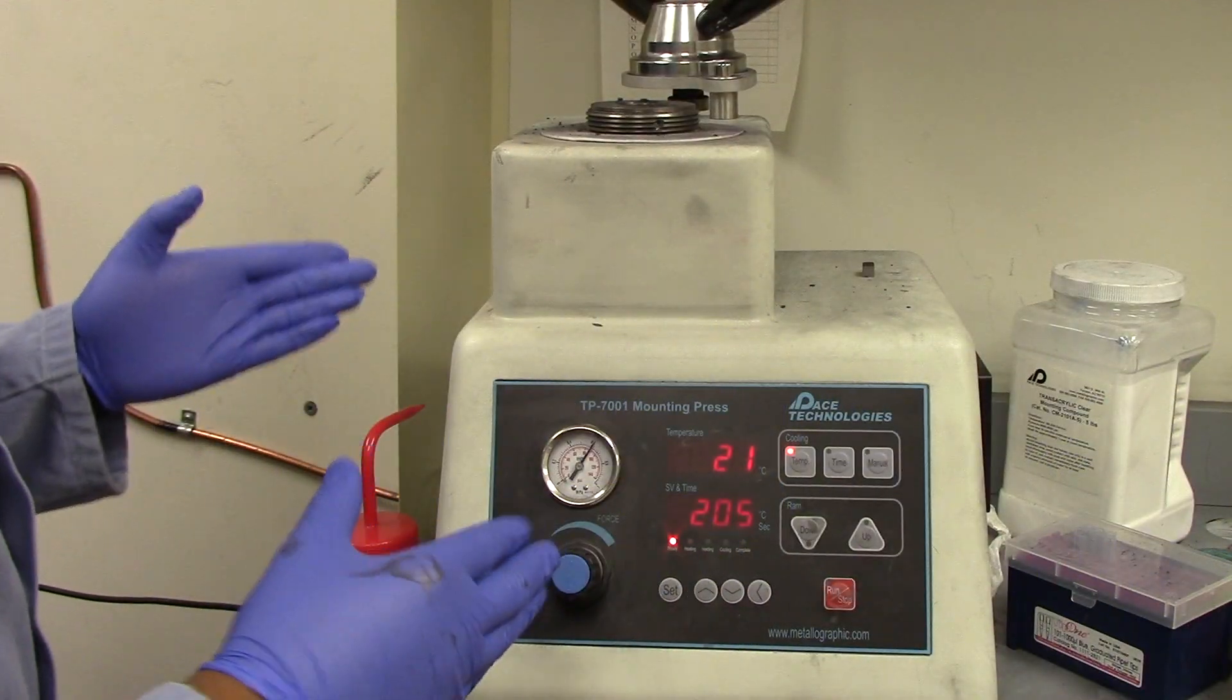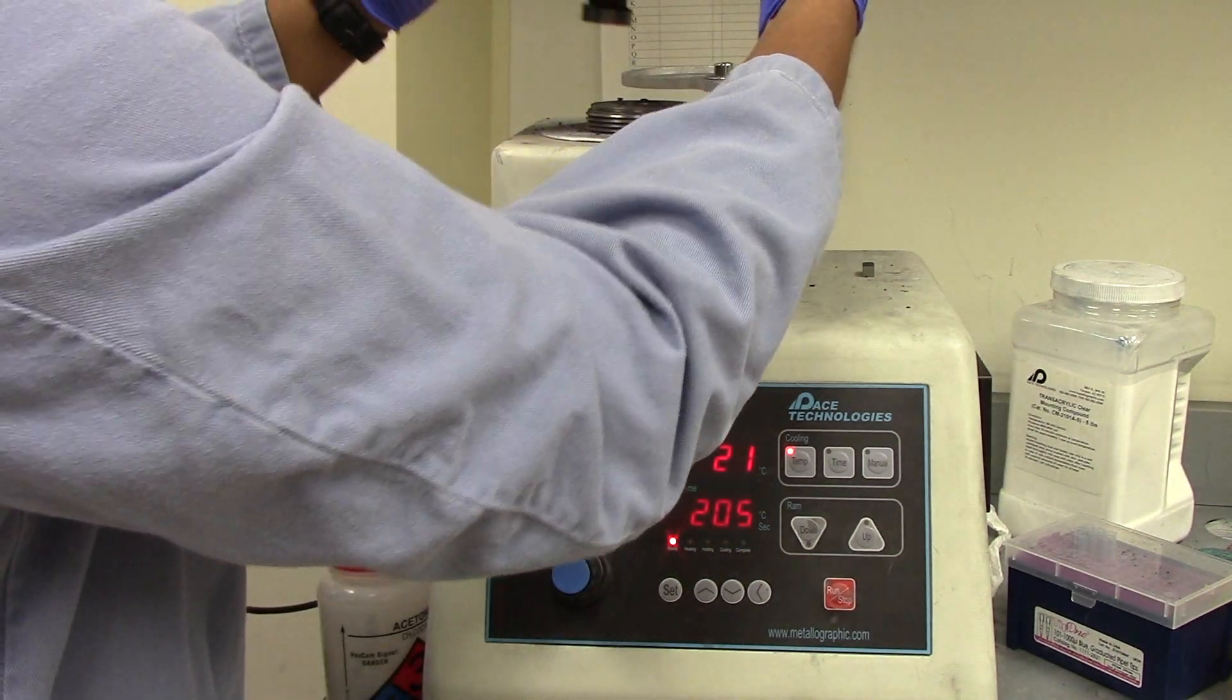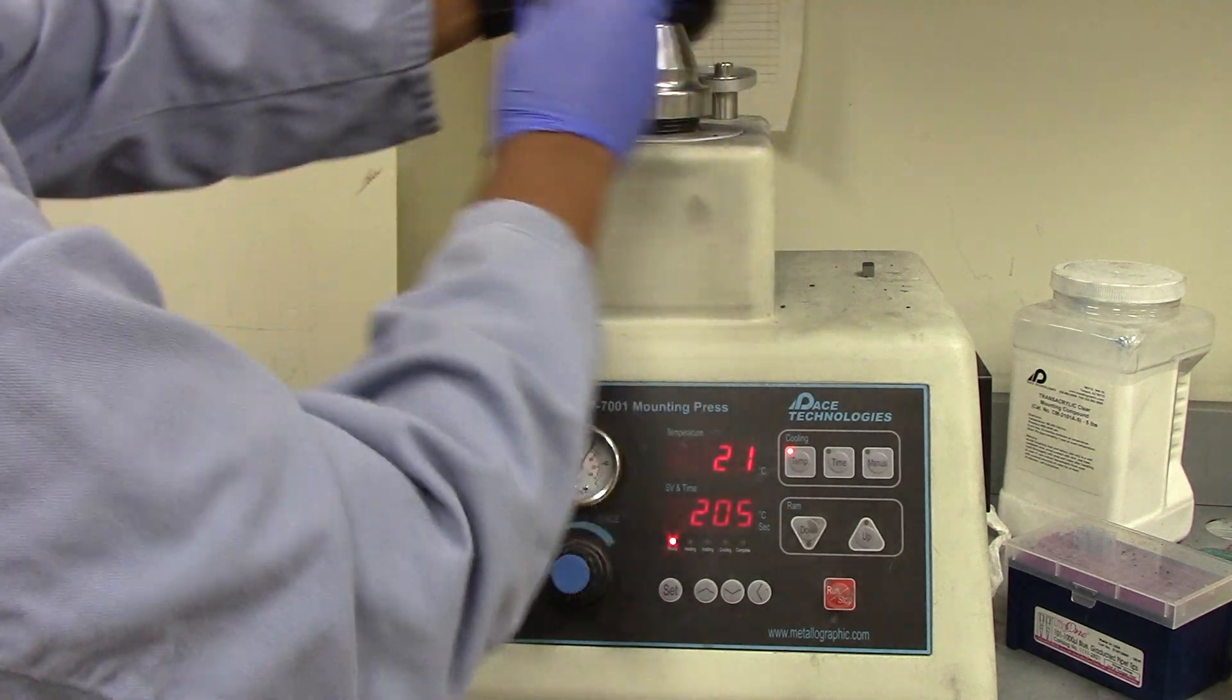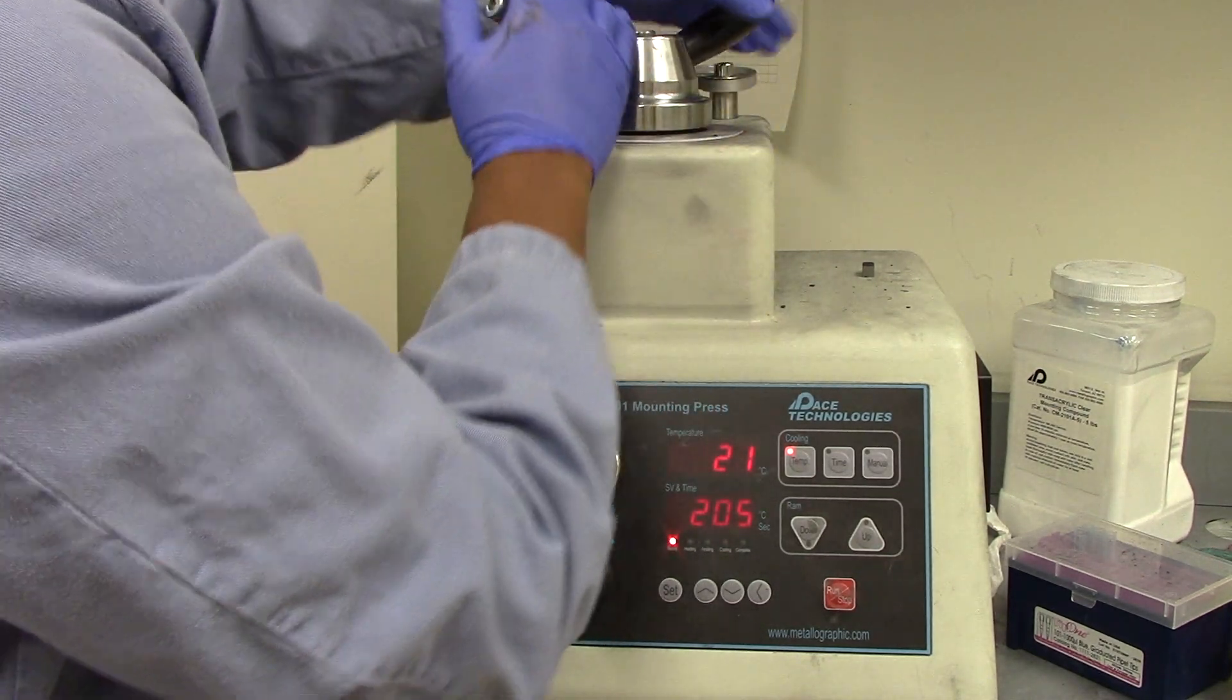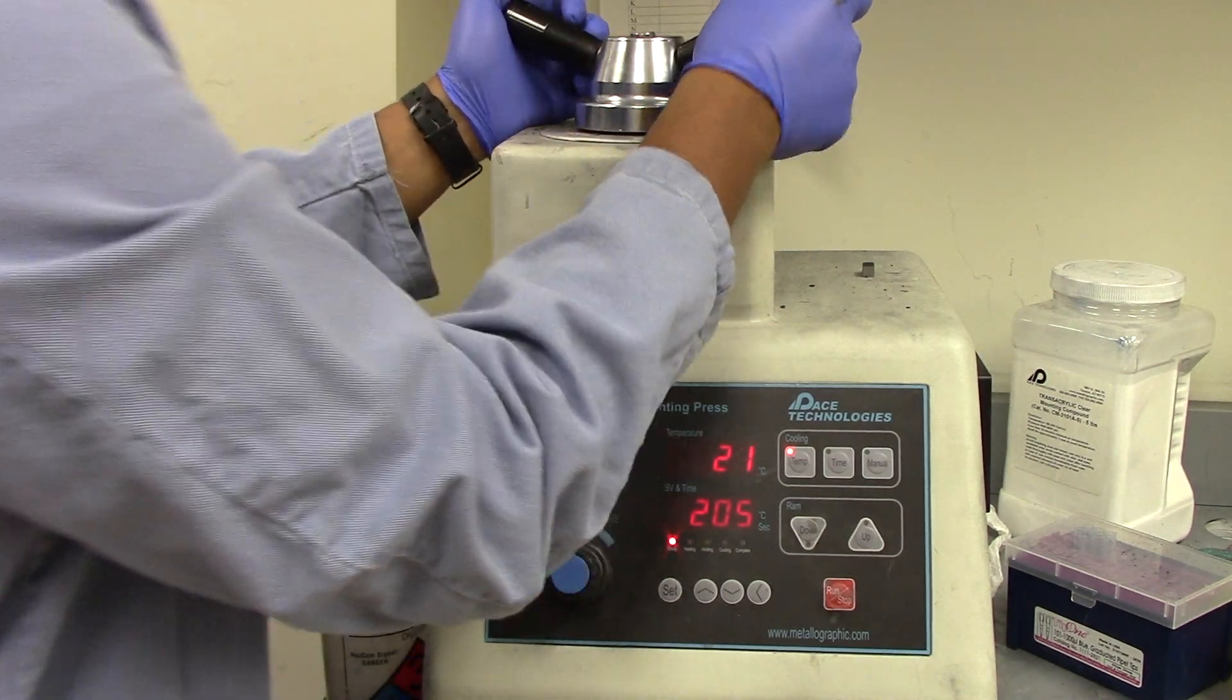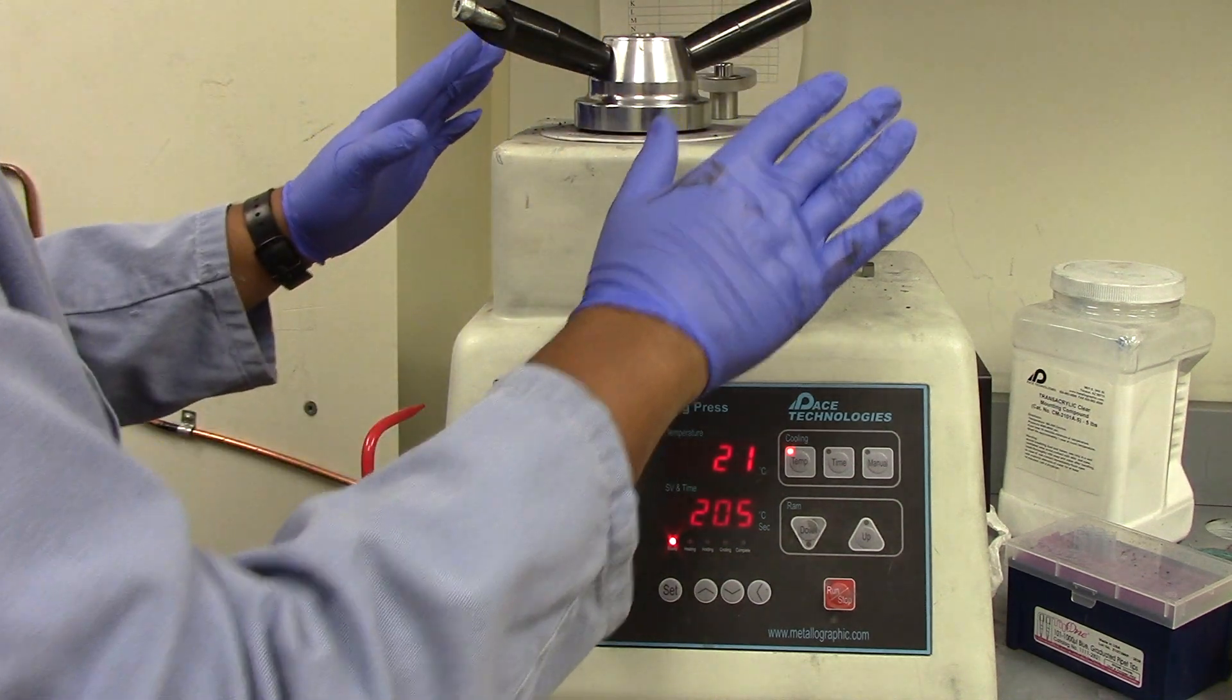Now that I have my sample and my mounting powder in here, I'm just going to take the top off and then completely rotate this. Bring it over here, get it nice and tight, and then just loosen it just half a turn.